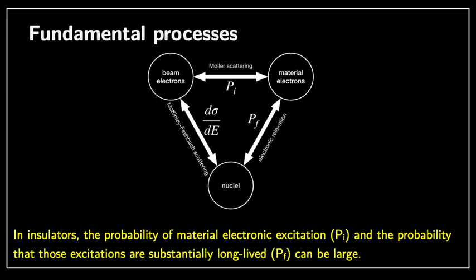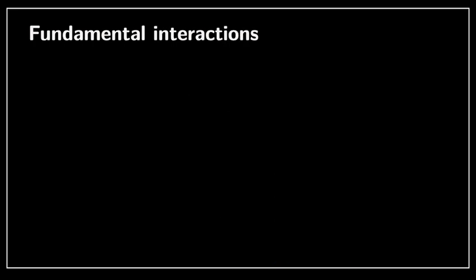Now, the reason why this is difficult is because it's difficult to see what is the interaction between a fast electron moving into a material and the electrons themselves. It's really the interaction between the bond electrons and an electromagnetic field, or in this case an electric field, generated by the electron moving. And this is not an easy problem to look at. It's not at all. In fact, if you want to solve it correctly, you need to use approaches such as quantum electrodynamics, and it's exactly what we've done.